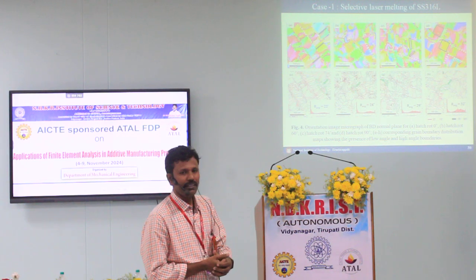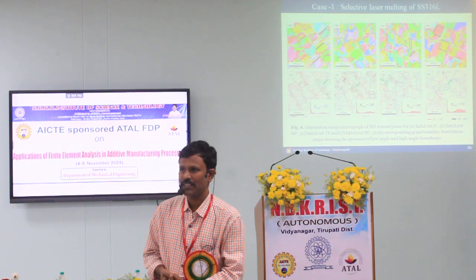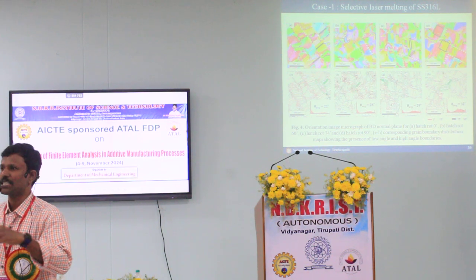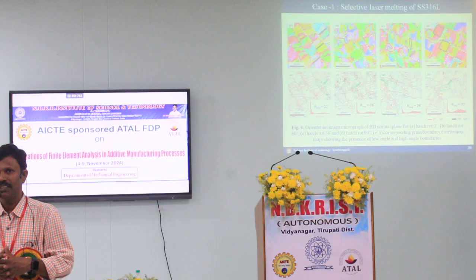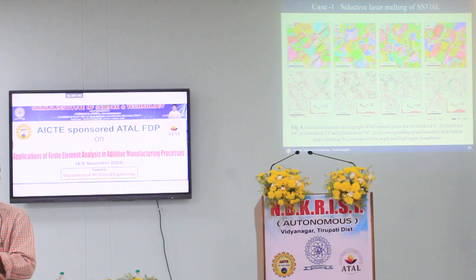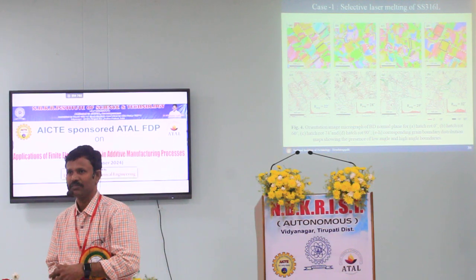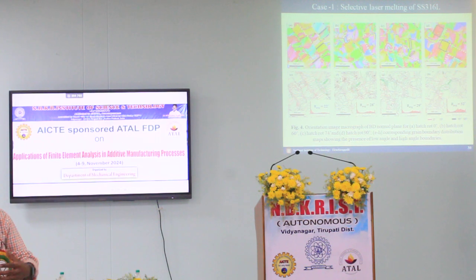Such a kind of material, if you analyze, this is an electron backscatter diffraction outcome. Electron backscatter diffraction is an attachment to SEM. Not all SEMs can have this one. It's an attachment. But if you have EBSD, not EDS, there will be so many terminologies like this. EDS, chemical composition. EBSD, electron backscatter diffraction. I said diffraction, so what does it give? Phase analysis, complete crystallographic information. It will give you this kind of structures also.